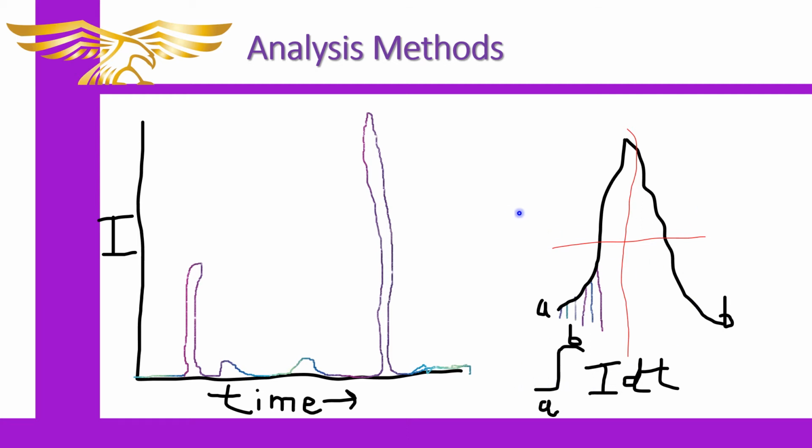And you can compare that to theoretical yield if you want. Because you can work through a reaction. If you know what your limiting reagent is, you can figure out how many moles theoretically you should have of each product, and you could figure out, if it was a mixture, what the molar fraction should be for each compound. So you can actually measure whether or not you're getting close to that by looking at the mole fractions.